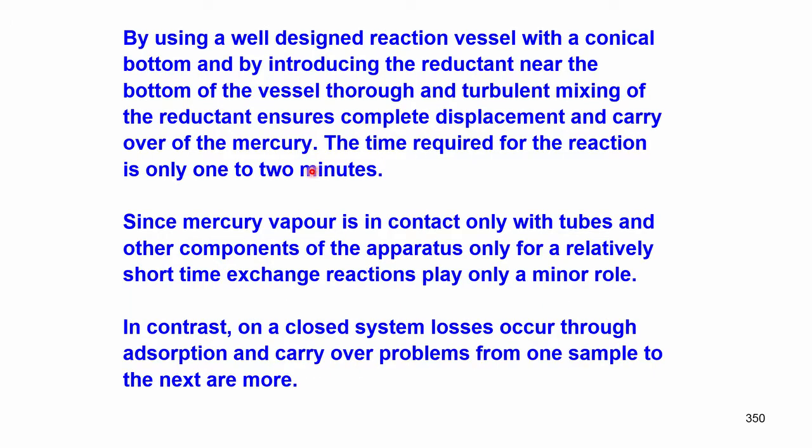So, reduction with sodium borohydride has assumed more importance compared to stannous chloride reduction. Since mercury vapor is in contact with the tubes and other components of the apparatus only for a very short time, the exchange reactions play only a minor role.